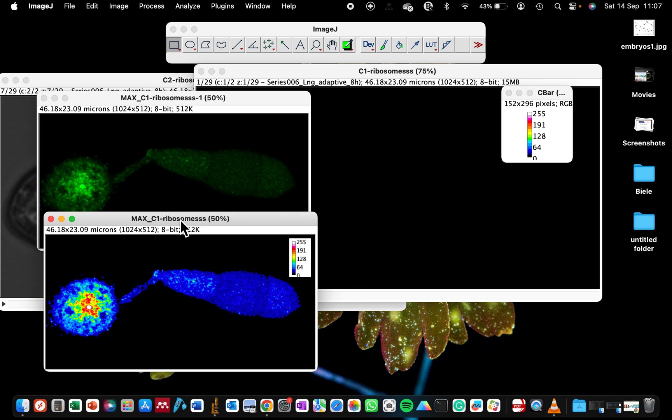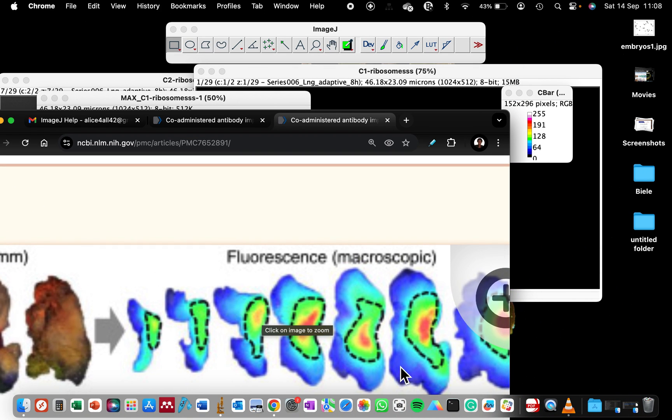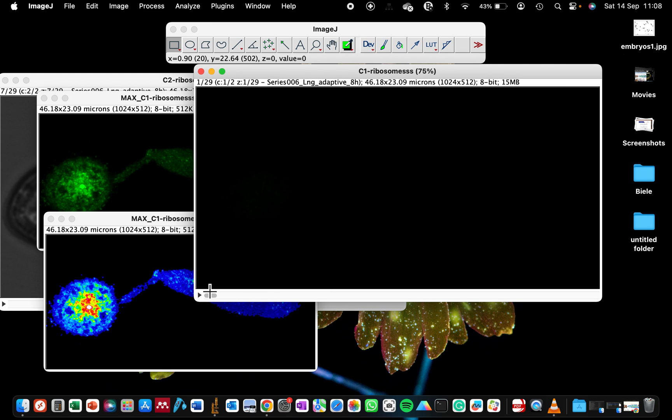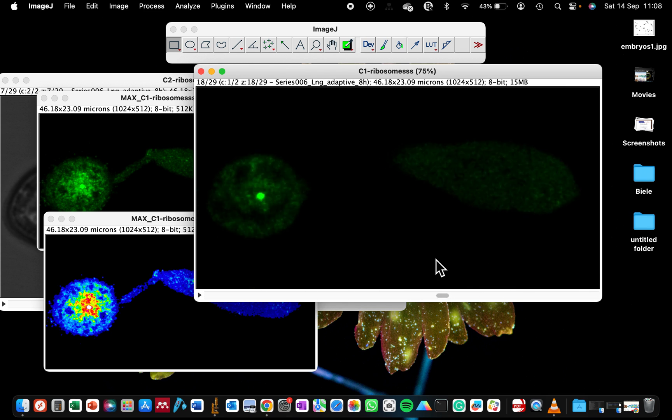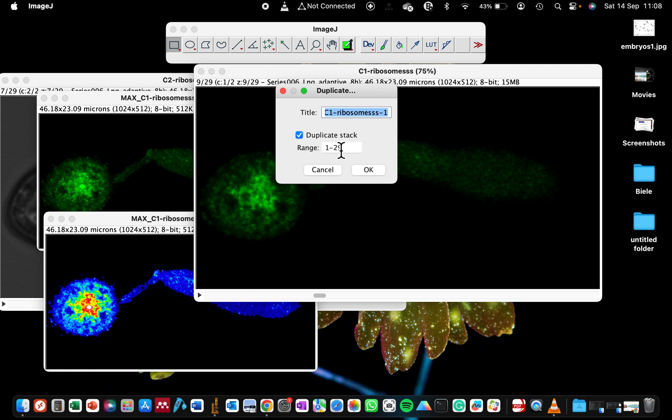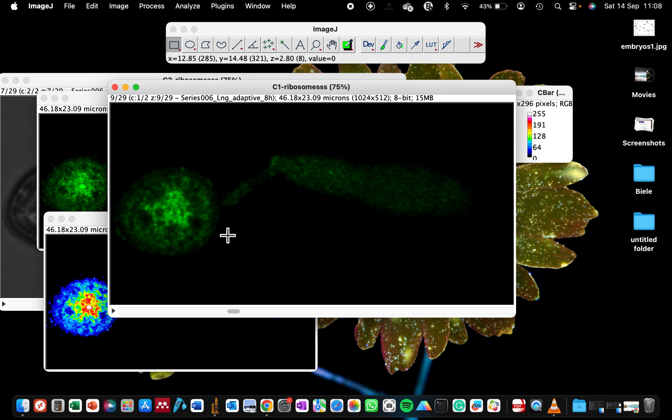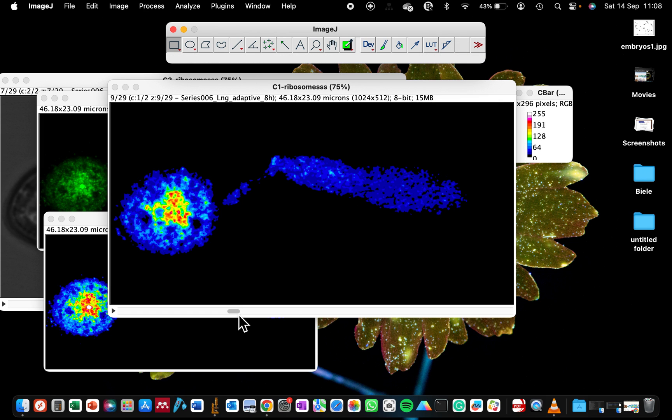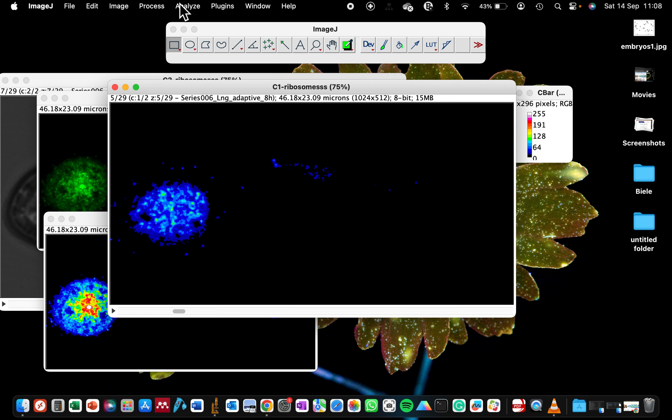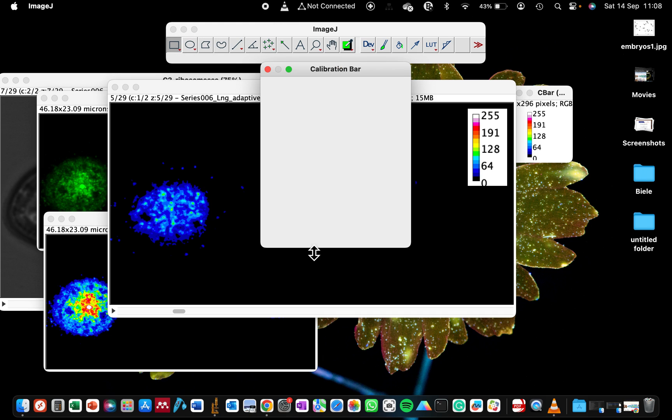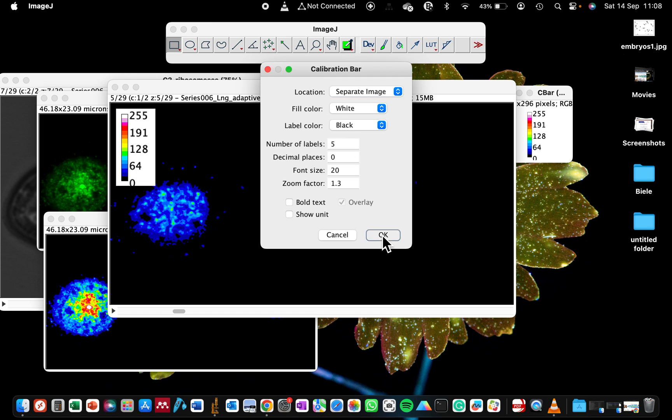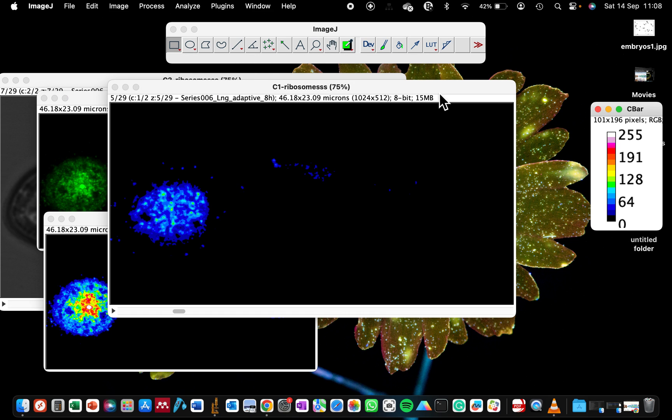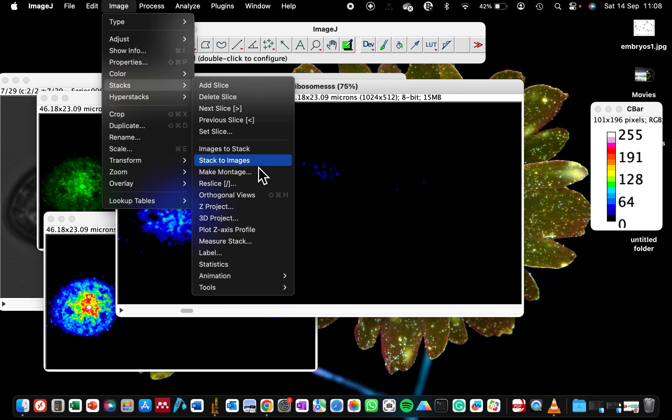If you want to make a stack whereby you will be able to make a montage later, I'm going to go back to the original image that I have. I'm just going to extract some section of this image for the sake of the montage that we want to make. To make our montage, we first do our color coding according to the different areas, and now we can make the calibration. In this instance it's best to put the calibration as a separate image. I'll close the one from before.